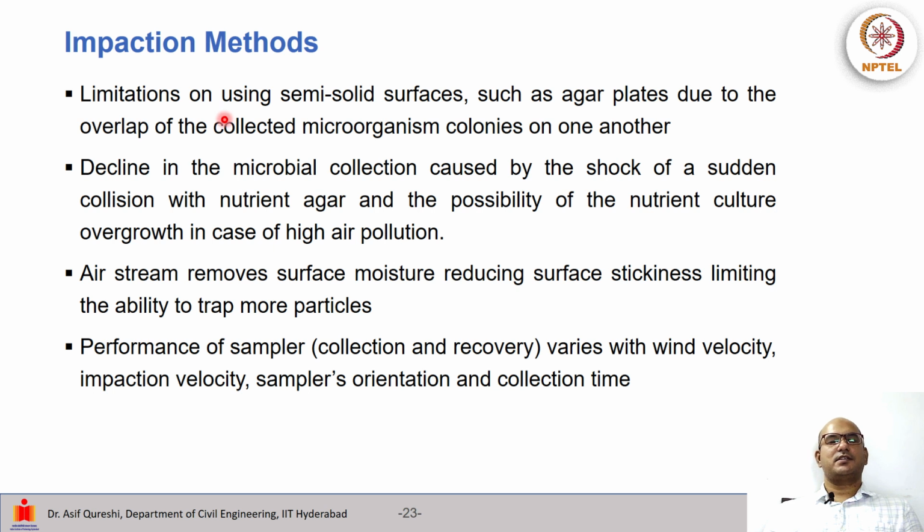There are some limitations, which is when we are using a semi-solid surface such as agar plates, there are limitations due to the overlap of collected microorganisms on one another. So maybe one gets collected over another. There may also be a possible decline in the collection, and this may be caused by the shock of a sudden collision with nutrient agar, and the possibility that the nutrient culture has overgrowth when we have a lot of air pollution.